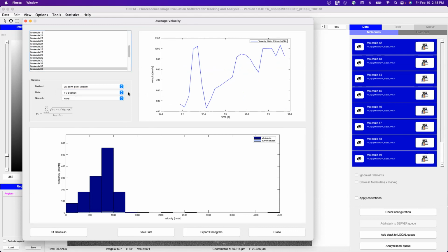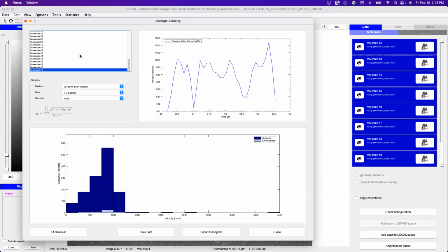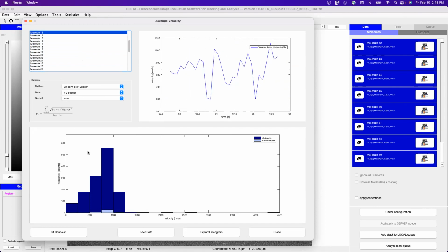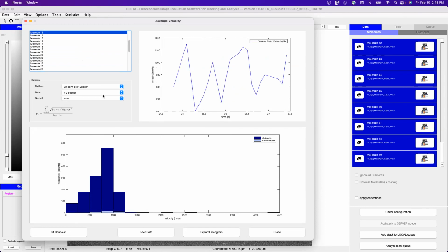Most of the time I just do it in MATLAB, because I don't know how much I really trust this. It's like a black box. We don't know how it works, and it could add data, it could delete data, and sometimes you don't have control. What does this do?